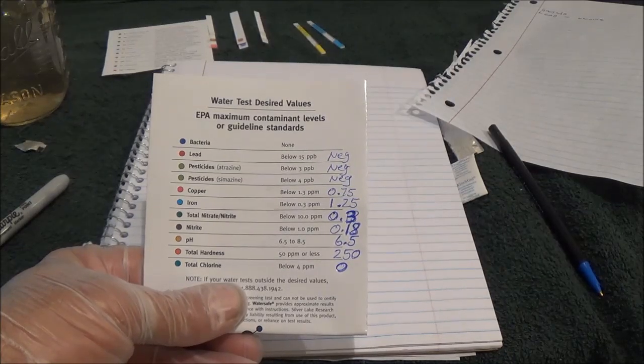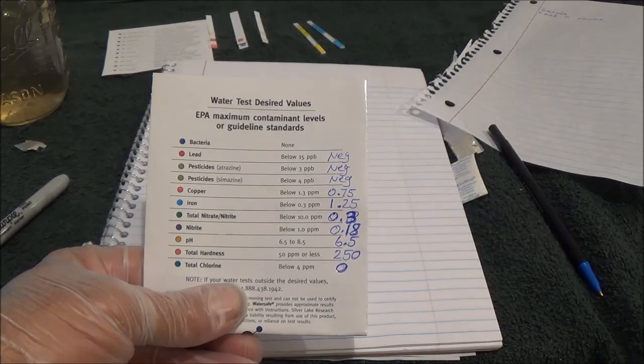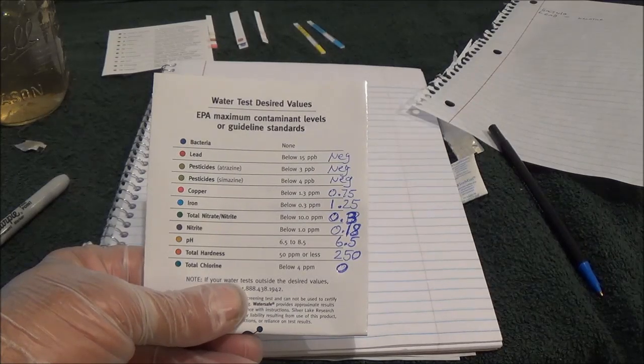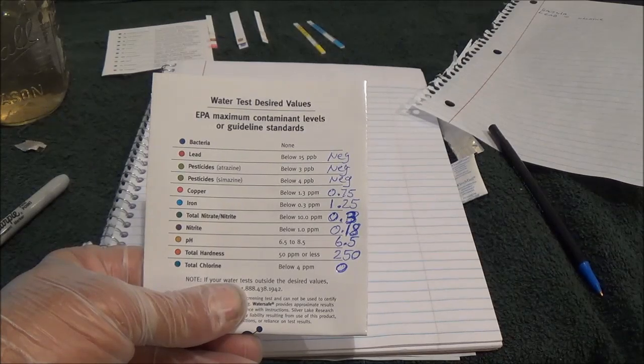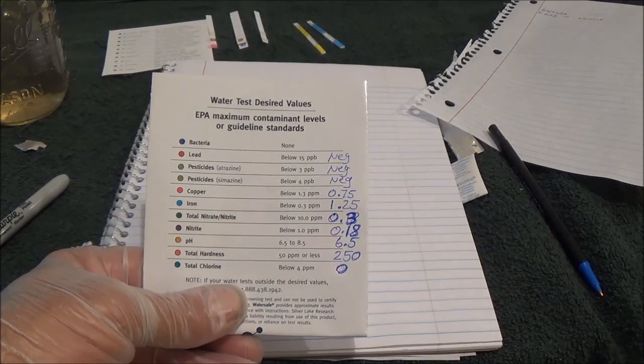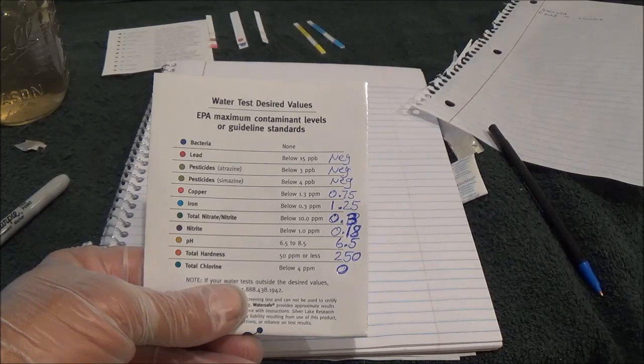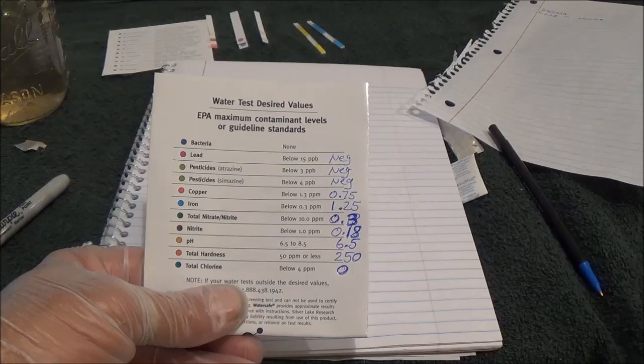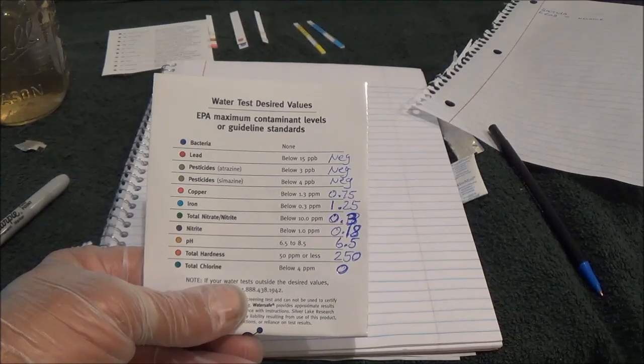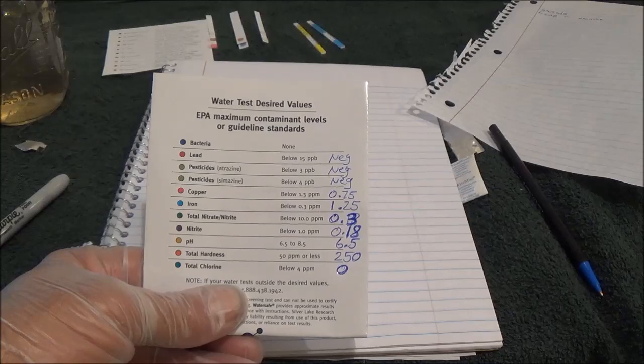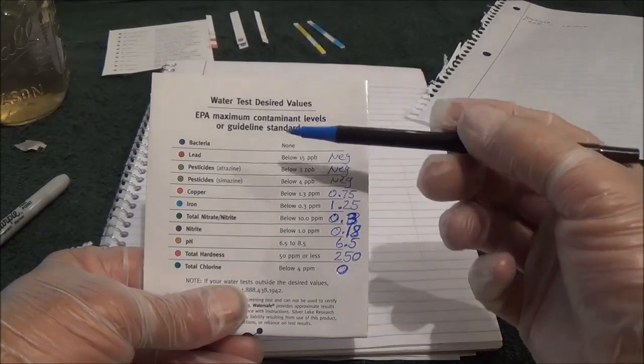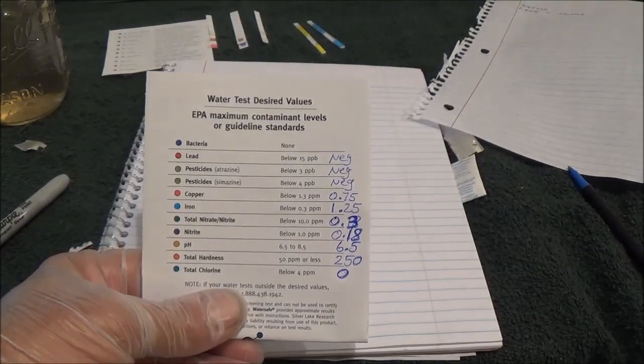Total nitrates and nitrite, whatever that combination was, was supposed to be below 10 parts per million. We were at 0.3. And nitrites were supposed to be below 1.0 parts per million. We were at 0.18. pH is supposed to be between 6.5 and 8.5. We were at 6.5. The total hardness of the water should be 50 parts per million or less. We were at 250. We knew we were going to have hard water, so basically it's saying don't wash your clothes. Total chlorine is supposed to be below 4 parts per million. We were at 0. So basically looking at all of this as far as drinking water, we're doing good. But the big one here is the bacteria, and we'll be back in two days to check that out and end this video.